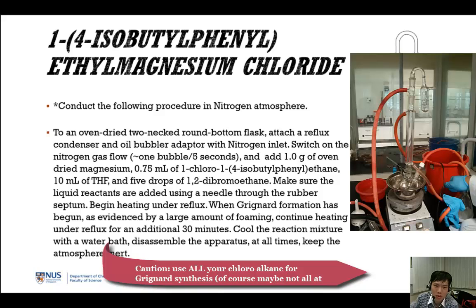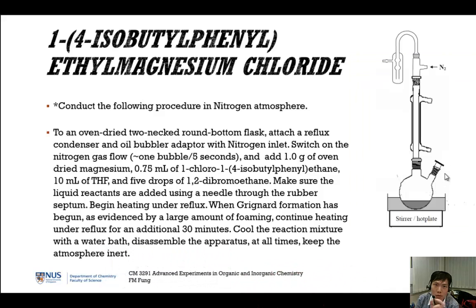Rubber septum. You got to fold it. It is secure. Nitrogen going in. Any liquid, right? You puncture the hole using a needle. Be careful. You're handling needles, okay? So suppose this is a needle. You put it in, right?